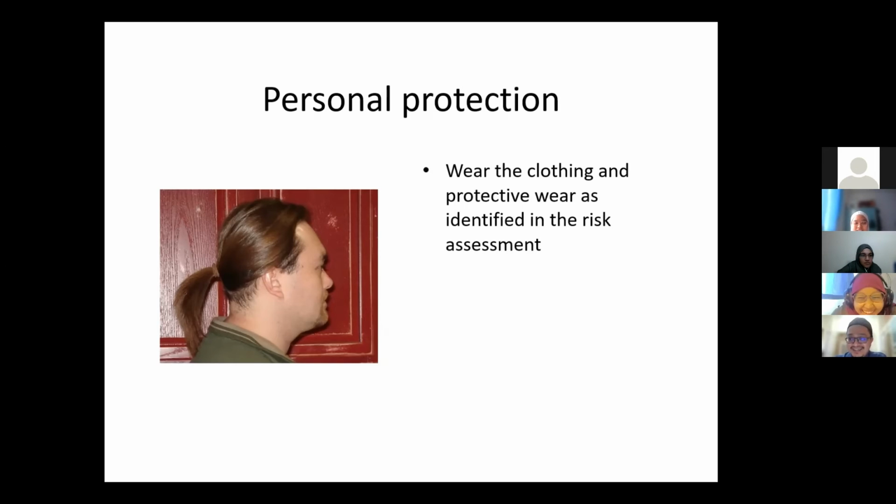Okay, it depends. Kalau if you are working in the lab like hematology lab, it is actually acceptable lah, sebab dia ikat dia punya rambut. Tak perlu sangat pakai tudung, pula dia tak perlu pakai cap. Cap tu hanya if you are working in the pharmaceutical plant, very sensitive lah, kalau ada sikit pun very sensitive. Okay, of food, tu memang perempuan pun dia kena tutup juga atas tu.